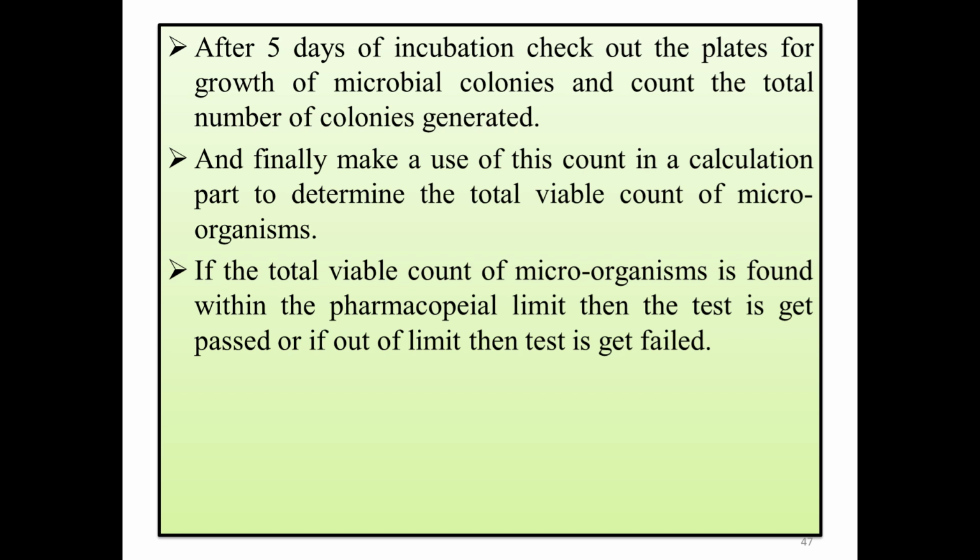They will form colonies, or a group of microorganisms. Colonies of microorganisms means the formation of a group of microorganisms. Then after the colonies appear in the specific media, we'll go for counting the number of colonies generated.